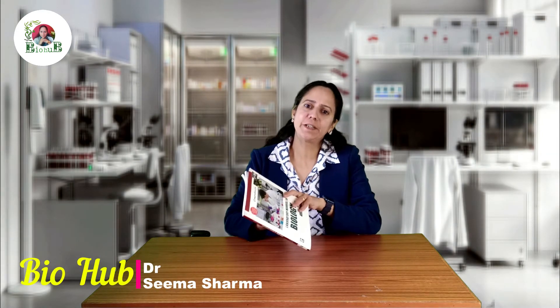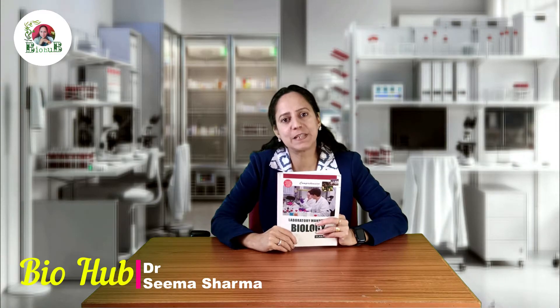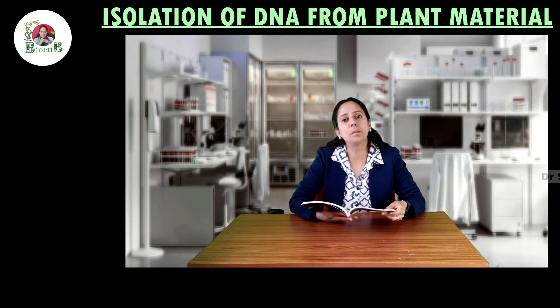Welcome viewers to yet another experimental video of BioHerb. I am your biology facilitator Dr. Seema Sharma. This video is about the isolation of DNA from plant material.